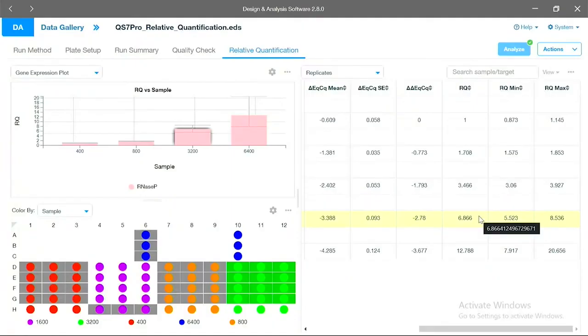Personal preference, I had a lot of room on the plate, and just to avoid any cross-contamination issues, I did. If I'd had more samples, I would not have done that. Sometimes if you have, say, an 8-column multi-channel pipette, you'll go every other one just because that's how it fits into a 384 well plate. So no good reason. Sorry.